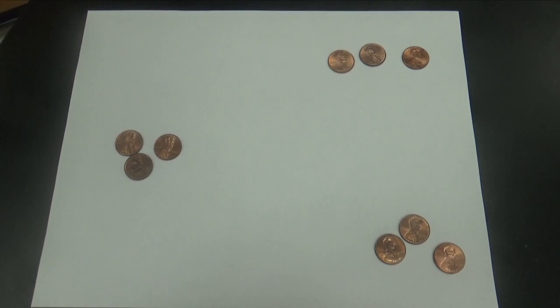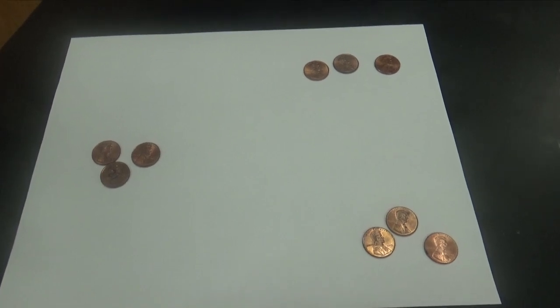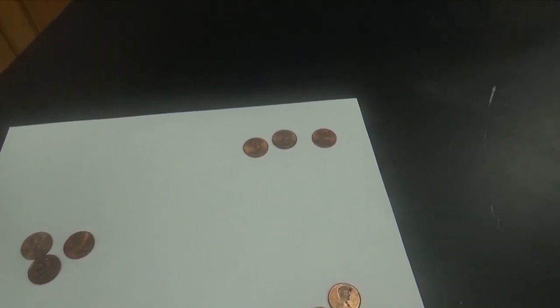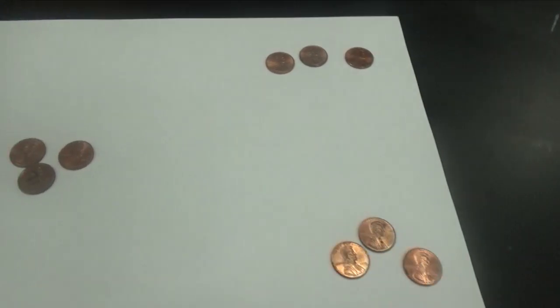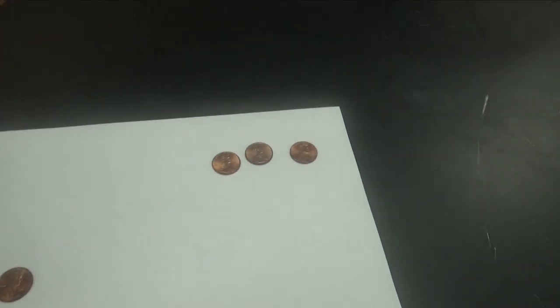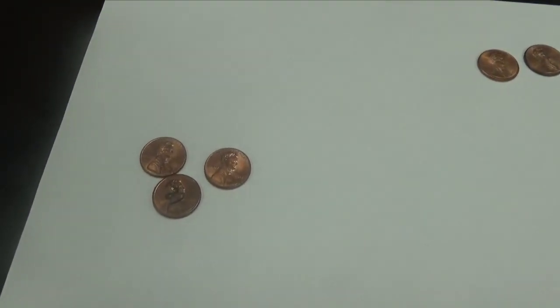In today's lab, we're going to determine the chemical composition of a penny. In 1983, the U.S. changed the way they minted pennies. Prior to that, 1982 and before that, pennies were almost all copper. Today, pennies are mostly zinc covered with copper. And we're going to determine what percent of a penny is zinc and what percent is copper.